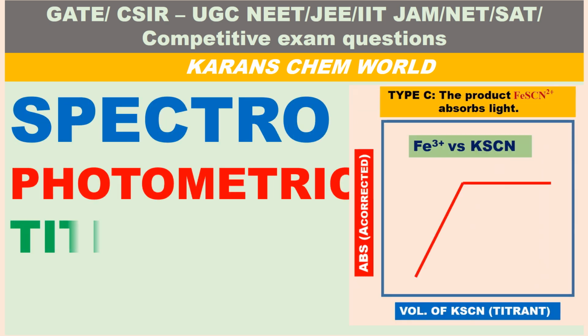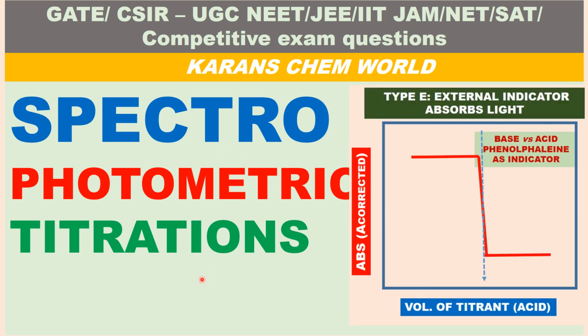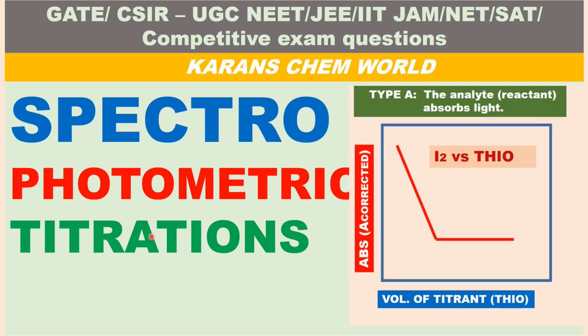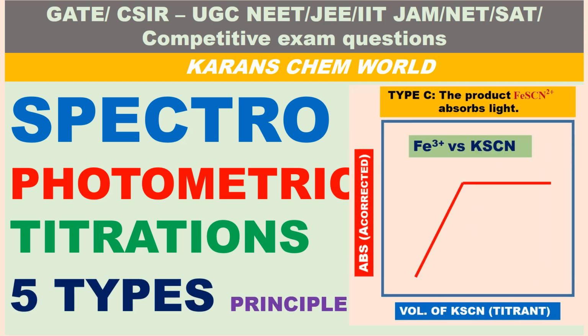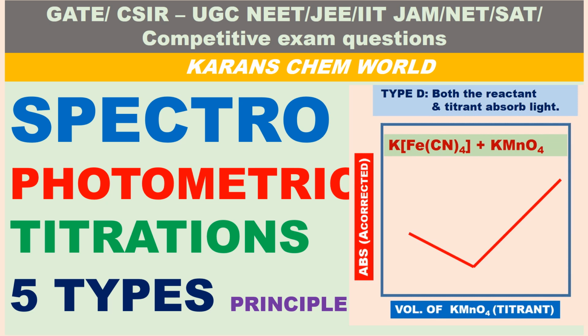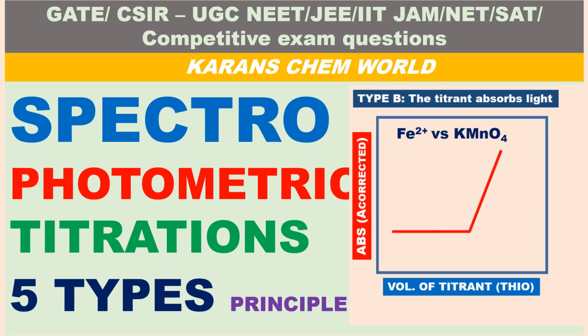In this video, let us study spectrophotometric titrations. It is also called photometric titrations. There are 5 types of photometric titration curves, and we will also discuss the principle and applications.